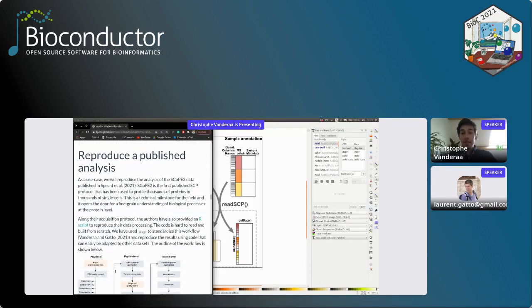All right, it's now time for the more hands-on, or at least the more practical part of the workshop. I suggest we take maybe not a break, but a break for questions. I see there are some questions in the question tab, so I'll take the time now to answer them. I see, for instance, Danielle says, where do the protein reference sequences come from?